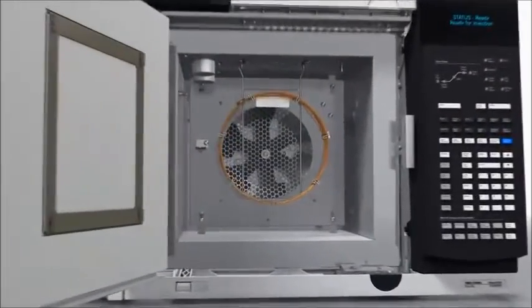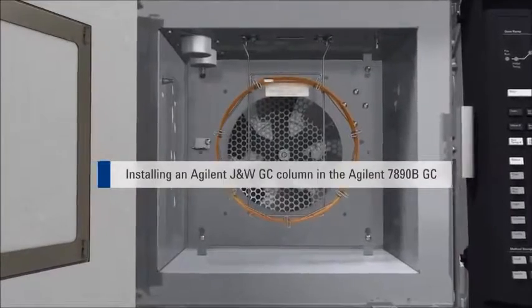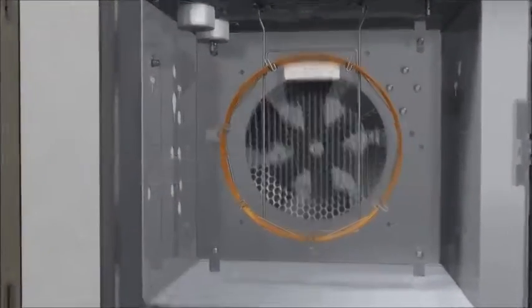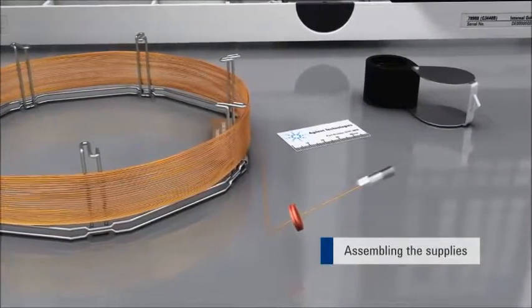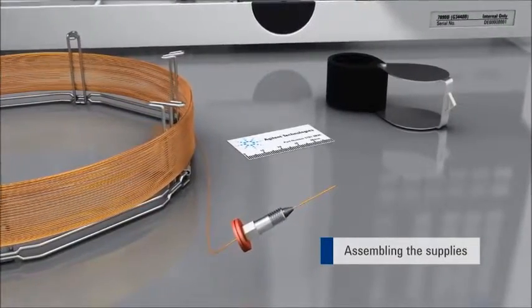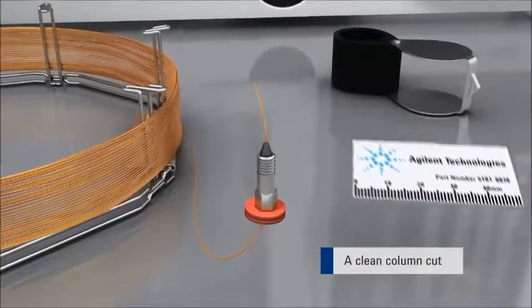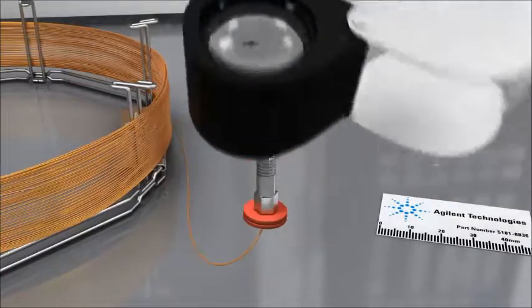The correct tools and supplies make proper GC column installation easier and ensure consistent, robust, leak-free connections and reliable results. Thread the column through an inlet septum and then through a column nut. Choose an appropriate column ferrule and thread the column through it. Make a fresh cut. Visually inspect that the end is free of chips, burrs, or uneven areas.